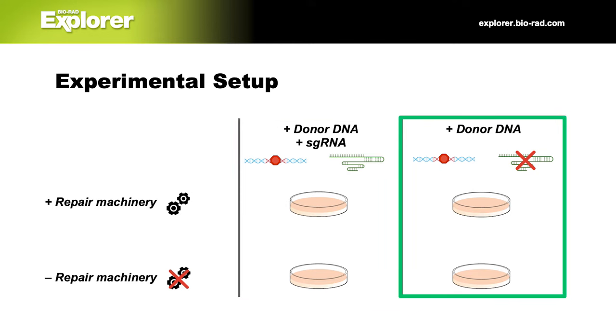Now switch over to the starter plate with arabinose. Use a new loop to pick 5 colonies from this plate and put them into the C tube. Swirl your loop around in the transformation solution and make sure you get all the bacteria off your loop. Put the tube back on ice once you're done.